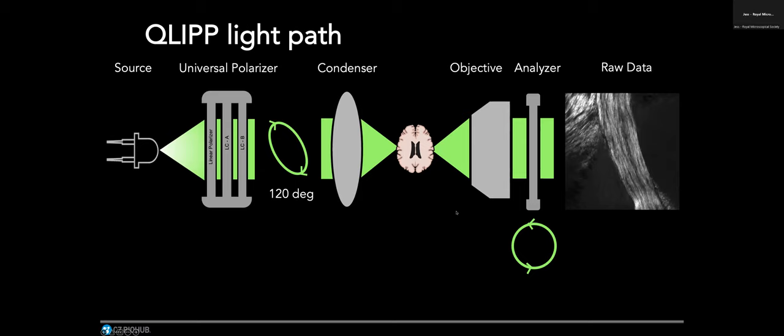And once we realized that there is phase information encoded as well, we thought about retrieving it from these stacks. The way we encode the phase information is by simply defocusing the sample. Defocus is one of the earliest methods for making phase measurements. And if it is done right, one can do quantitative phase imaging with it in a very inexpensive way with very simple hardware.